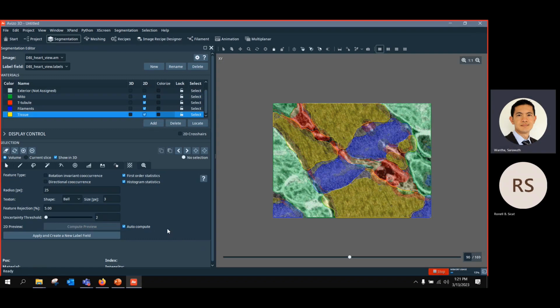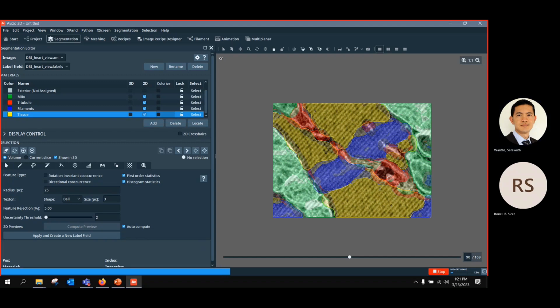It looks pretty okay. And then you just run, and it runs to find the similar pattern that corresponds to this marker for all images. But as I already said, because I didn't paint quite so accurately, you can also expect that the result will not be that good.